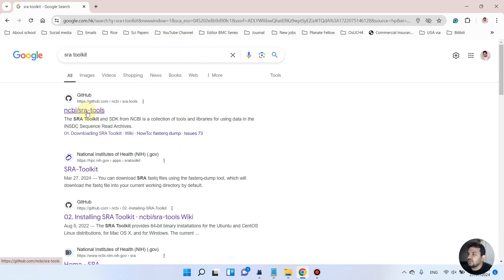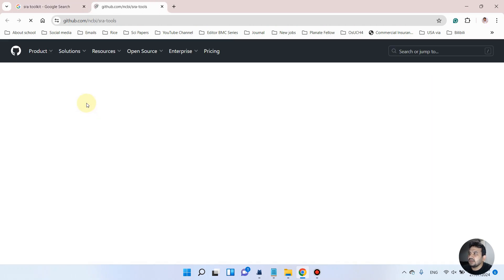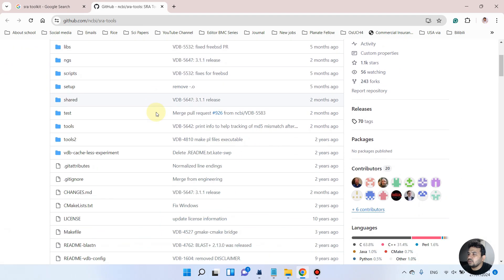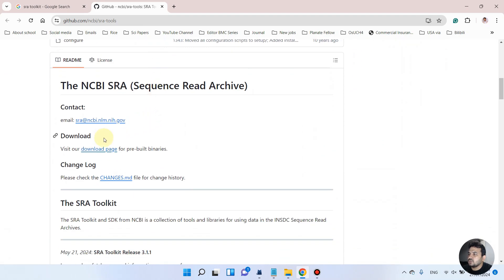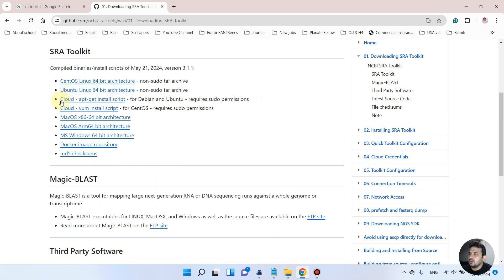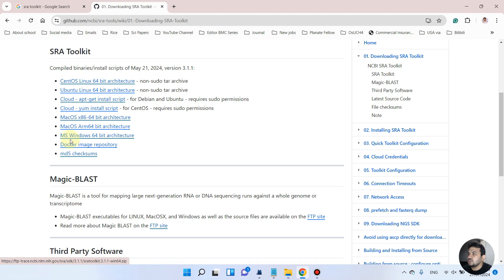On the first link we are on the GitHub page, so we will simply click on this. We will go to the download page, and since we are using Windows, I will click on the MS Windows 64-bit architecture option.